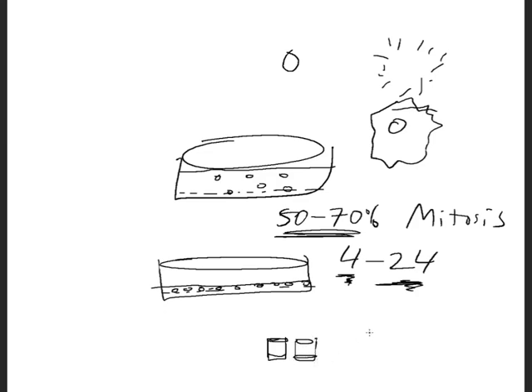It all depends upon what you're trying to do. We're not trying to get a huge amount of cells transfected. We just wanted to make sure that it worked and that you're going to be able to get some observable cells. And again, you can still get hundreds of thousands of cells in these 96 well plates. Generally, if you use a larger plate, like the ones we did our cell culture with, you would get a lot of cells transfected, but the big question is why? What are you looking for? We're not looking to transfect all the cells. The whole purpose of this lab was primarily to introduce that plasmid that had that gene PLIN2. Now, let's talk about that plasmid and whatnot.